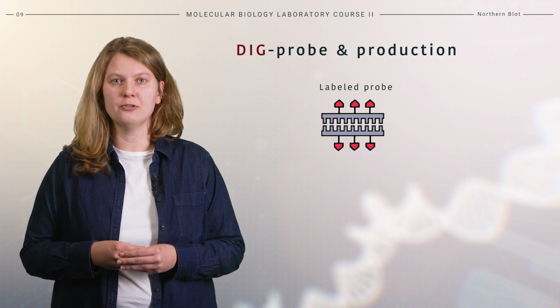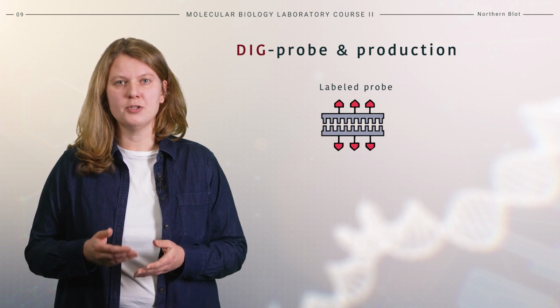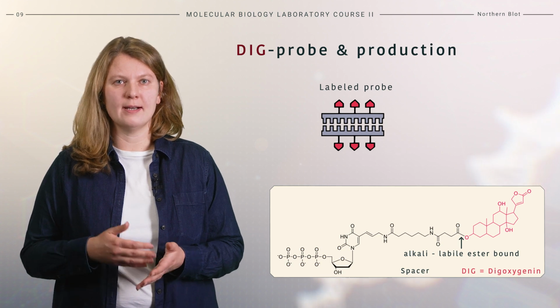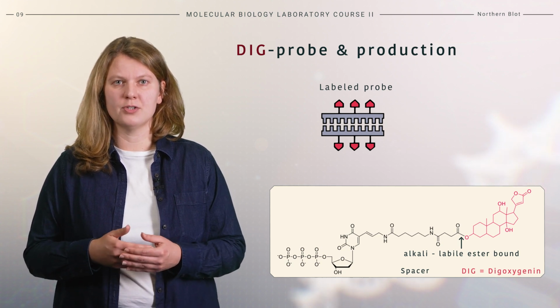A commonly used non-radioactive detection method is using the probe labeled with digoxigenin. The probe is then detected using an anti-digoxigenin antibody.